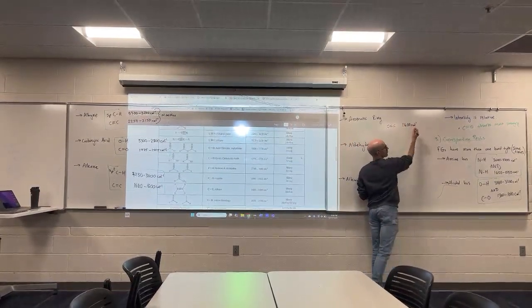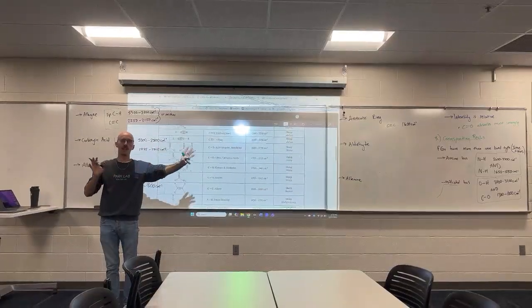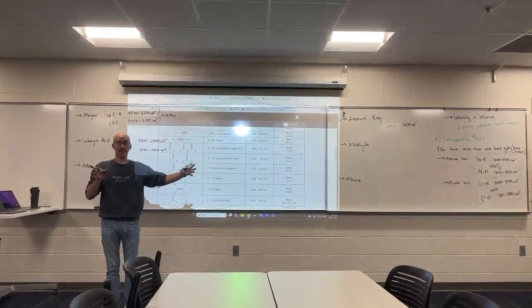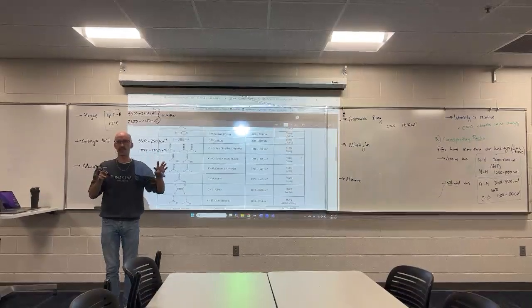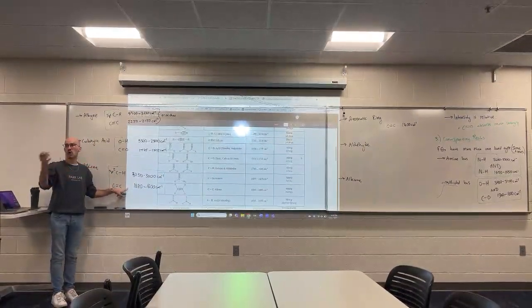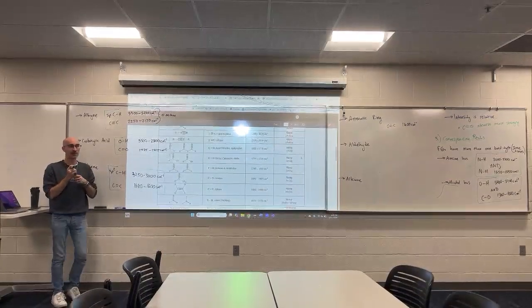I do want to point out there's a lot of resources that will give you more numbers. Like some resources will say 1600 down to 1450, but it's like 9 times out of 10. If you have an aromatic ring, the CC double bonds absorb at 1600, give or take a few wave numbers, which is different than the CC double bond of the alkene, which has a bit of a larger range. The aromatic ring is 9 times out of 10 right at 1600. Pretty convenient. And then you guys want to give me a signal that you found?